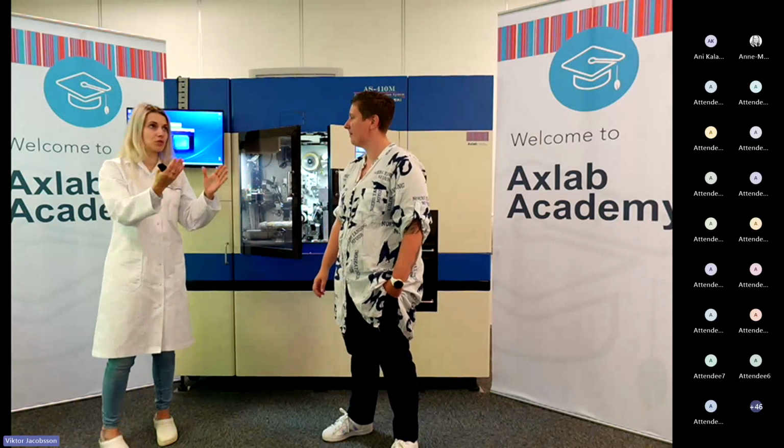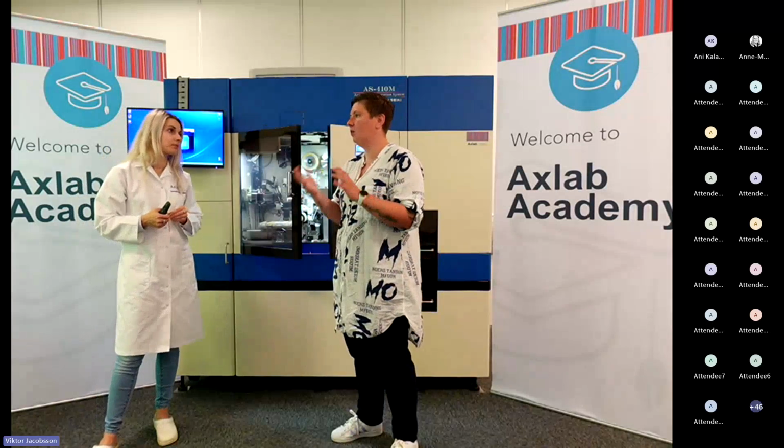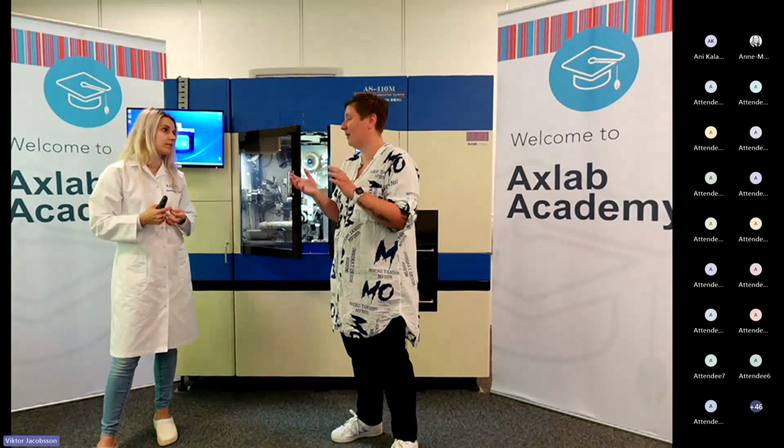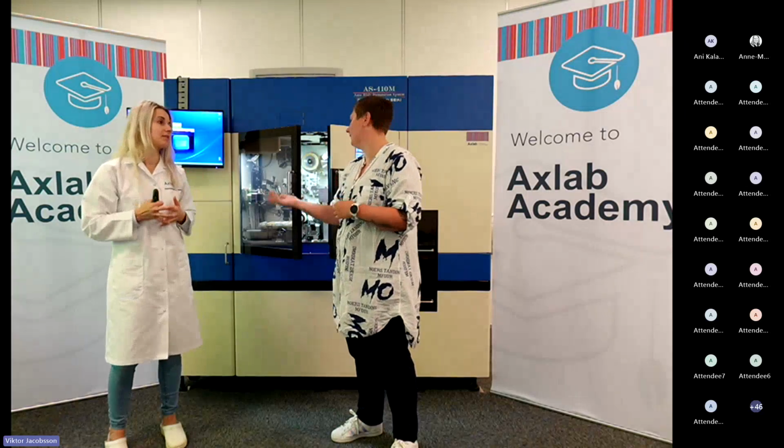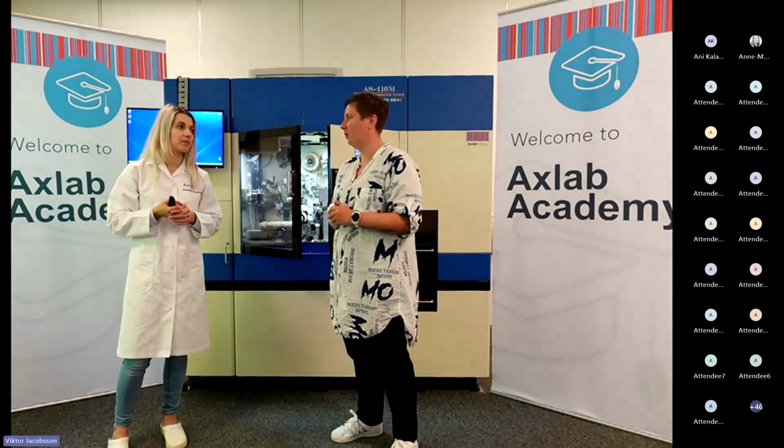So yeah, it starts from the start, you can say. And I just had a question. What would you do if you for some reason saw that the tissue were not aligned from the embedding? Would you then trim to a certain point, or would you then go for having it re-embedded? I think for the most part we will have it re-embedded, because then we could make sure. But it's always a thing you have to think about: is it time consuming doing the one thing of them? But again, you can't just trim down to nothing. You have to have an amount before the AS can take. Exactly. Yeah. So it's a lower limit. Yeah, exactly. So for the most part, I think we will re-embed it.